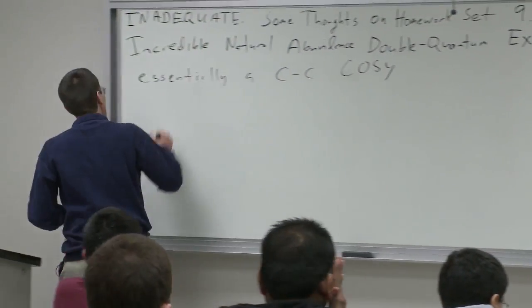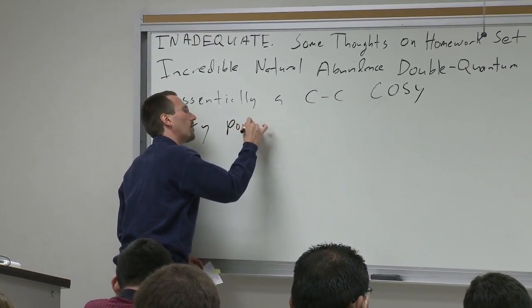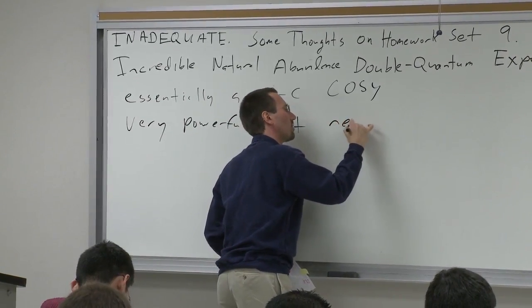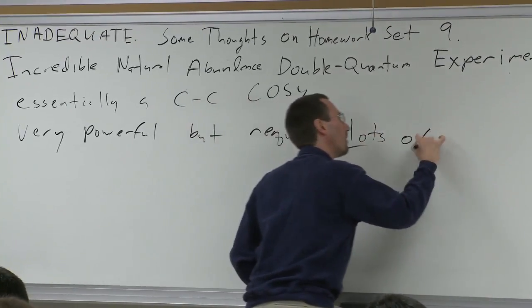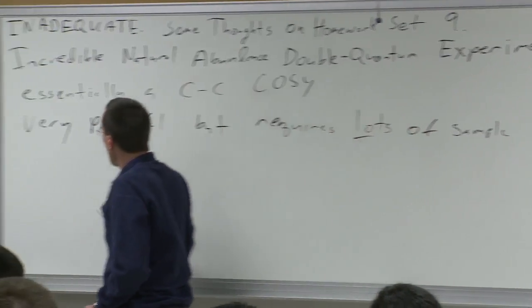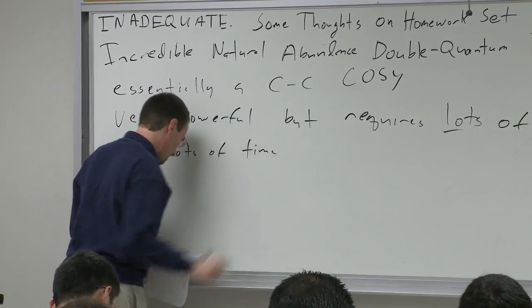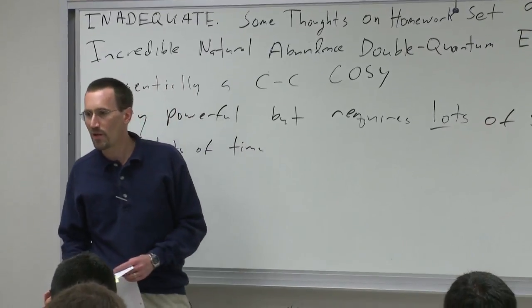So I'll say very powerful, but requires lots of sample and lots of time. By lots of sample, I mean like 100 milligrams.